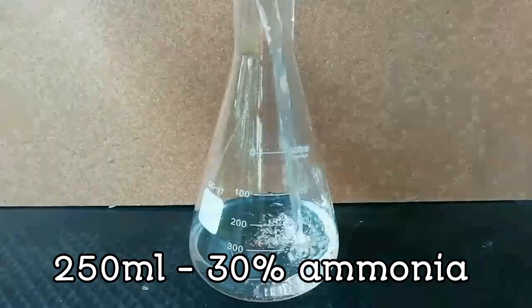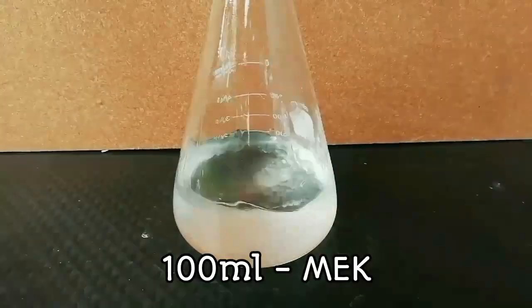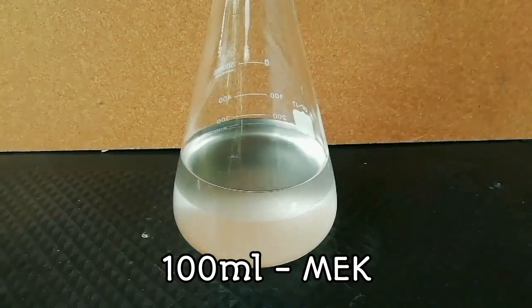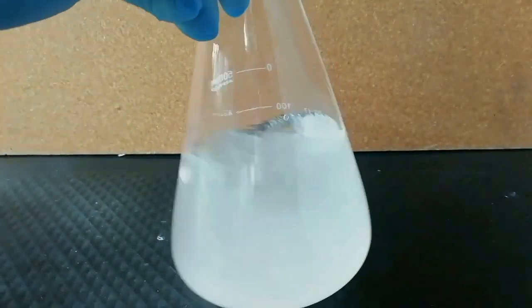First, 250 ml of 30% ammonia is added to a 500 ml flask. Then add 100 ml of methyl ethyl ketone, also known as MEK. Then mix the solutions well.